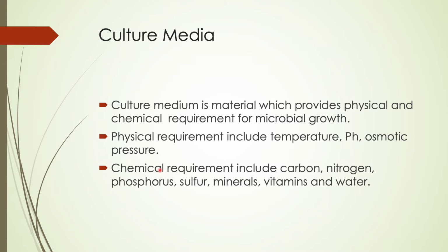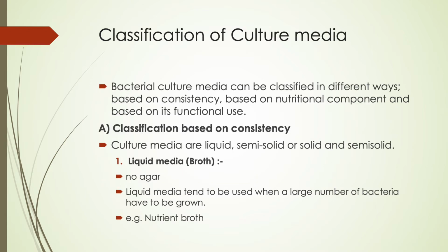So what does the culture media consist of actually? It consists of peptones as a source of nitrogen or proteins, and it has a source of minerals, etc. In the next slide, we'll discuss the classification of the culture media.